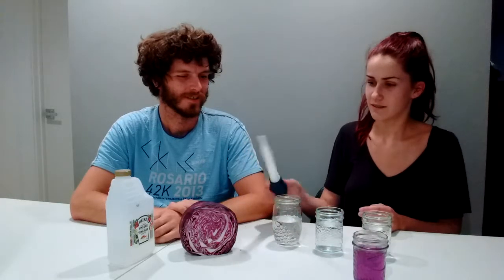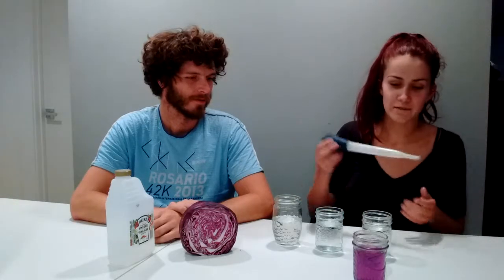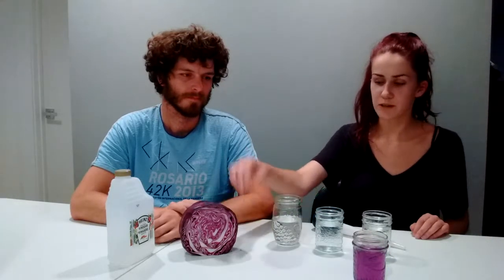So by the end, we want to show which kids got infected. And this part's usually fun because we'll tell the kids as they're coming up, oh, you got the disease or you didn't, and they'll get all excited about whether they died or they survived. So that can be fun too. But anyways, we'll take some of our indicator, and what we did here is we boiled red cabbage. I took about half the cabbage and boiled it in maybe 2 cups of water, and then let that sit for about 10 minutes, and then it comes out purple.